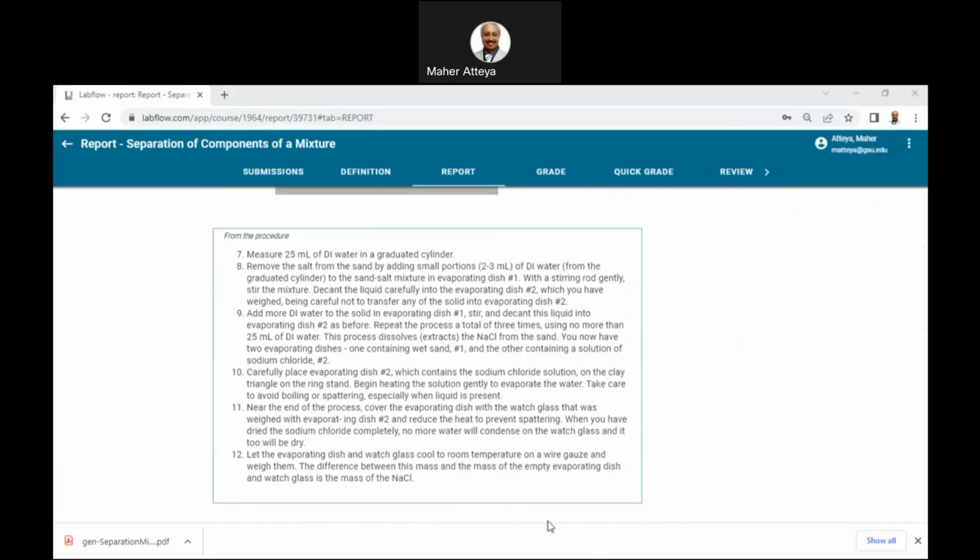Okay, let's get this one here, new. And then from there, we can correct all this. So copy, come here, and paste.